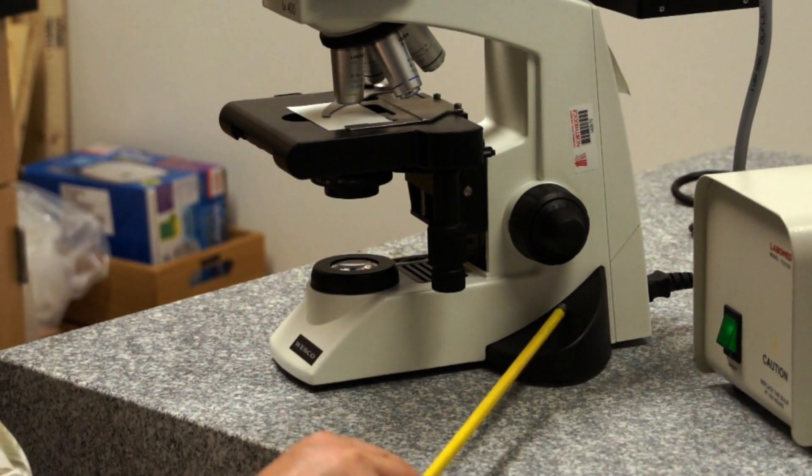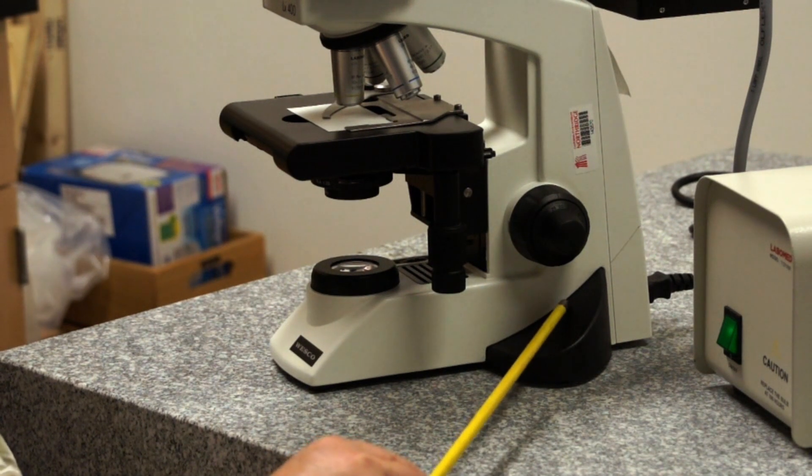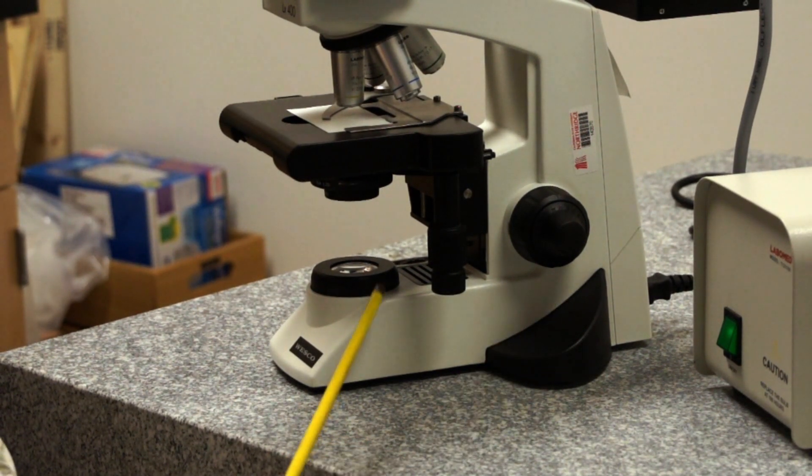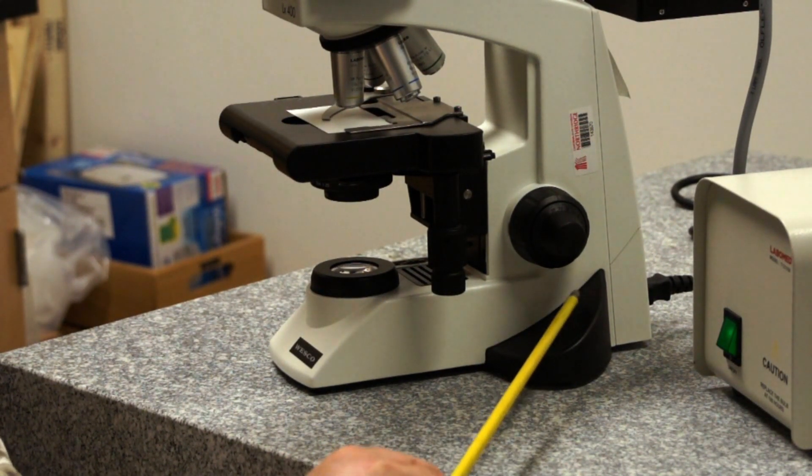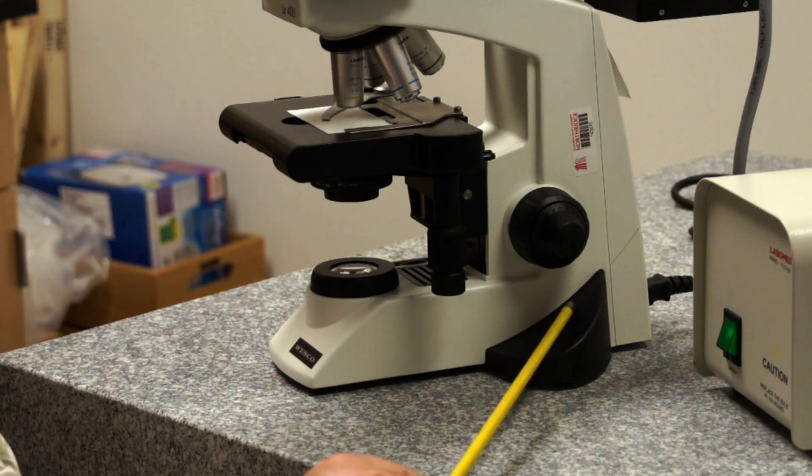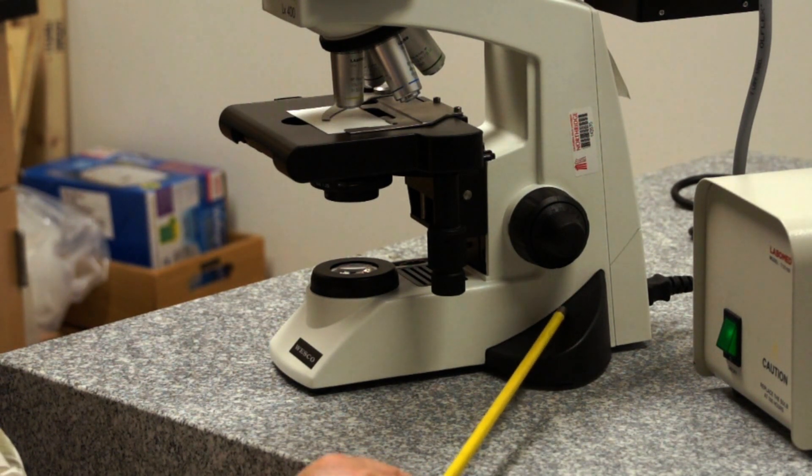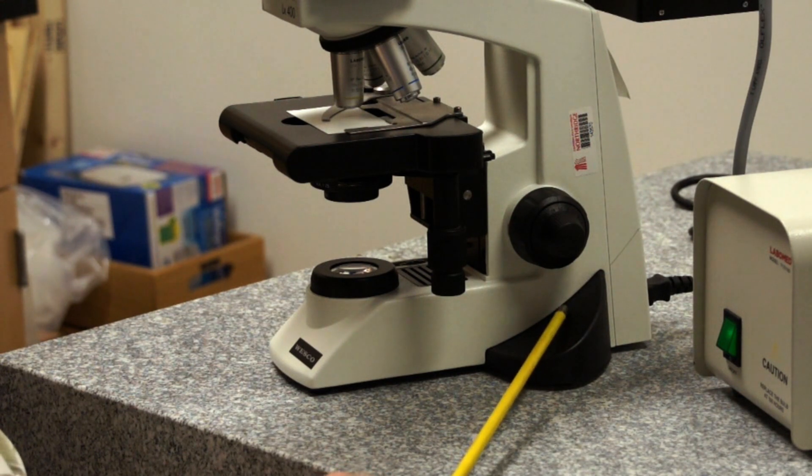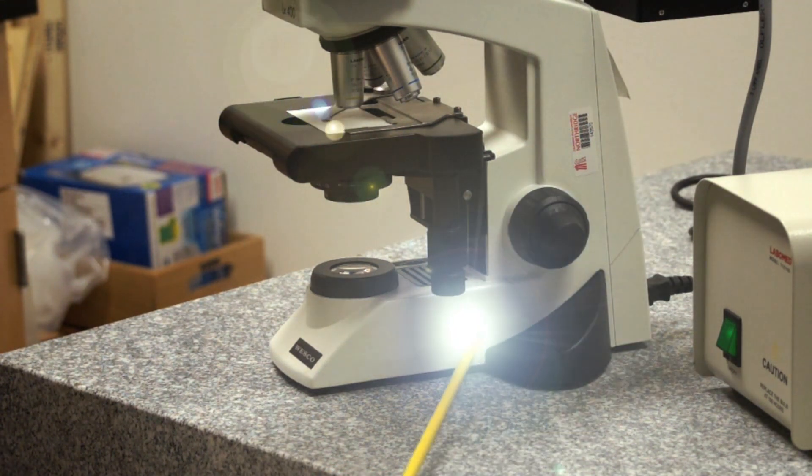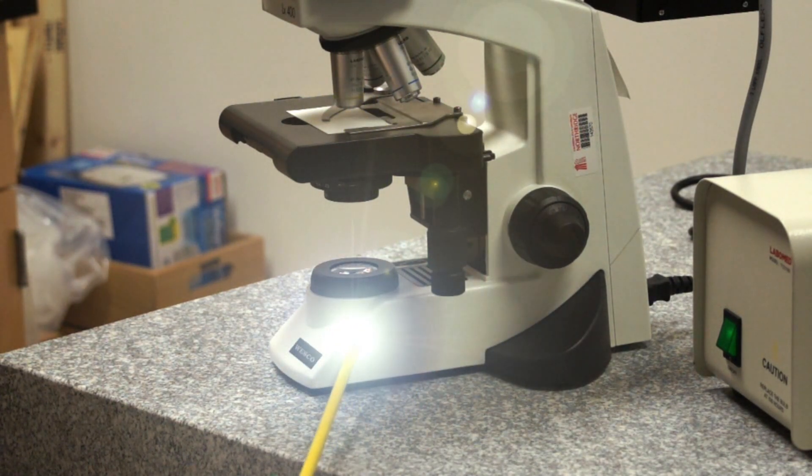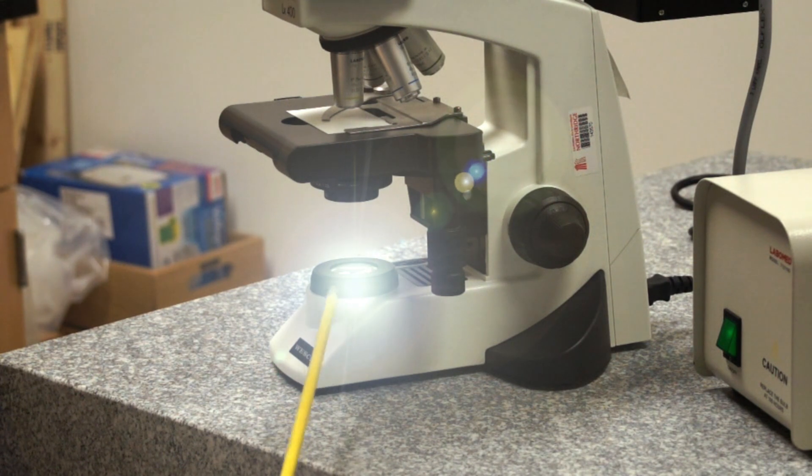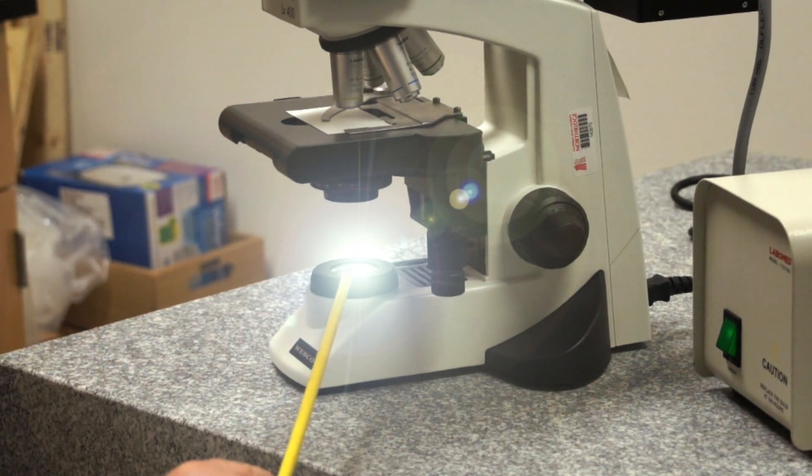But let's begin over here with the microscope. Built into the stand in the base is an illuminator. An illuminator supplies light to the microscope. In this case we have a tungsten halogen illuminator built into the base with a tungsten halogen bulb that burns very bright and very white. That light travels from the bulb and the lamp housing up to a right angle mirror in the base, and then it comes vertically through the field diaphragm of the microscope.